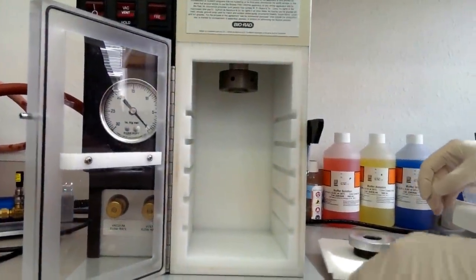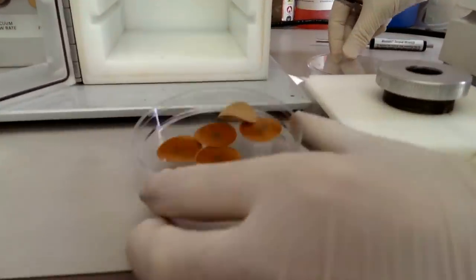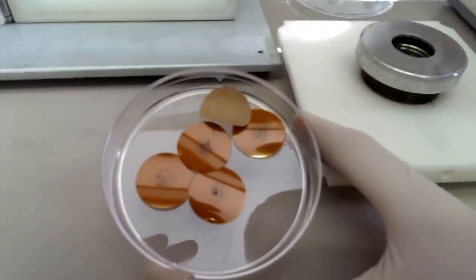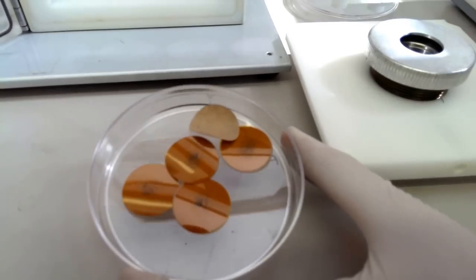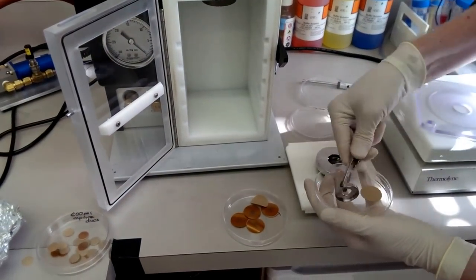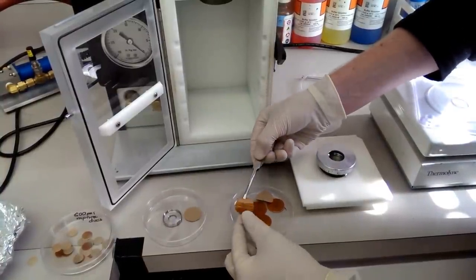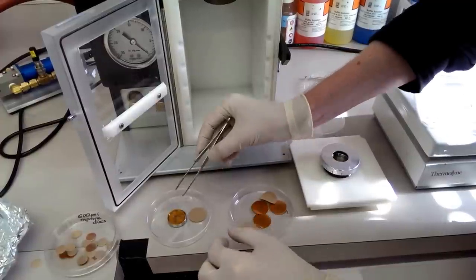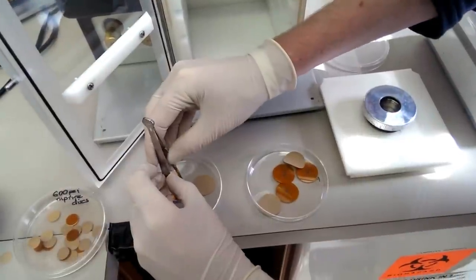Next, we need our DNA-coated nanoparticles. So that's what we've got here. If you take a look, these are some tungsten nanoparticles that I've already pre-coated with DNA. At some point, we'll probably take you through that step as well, but not today. So what we do is we load that into this little metal piece here. Careful not to scrape the DNA off, because that would be bad. And then just push it in. Make sure it's in there nice and tight.